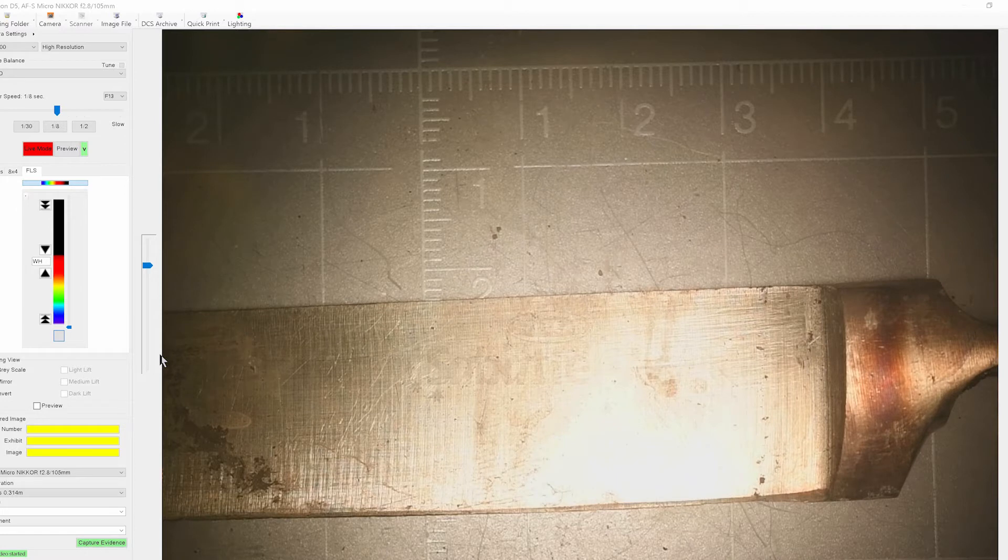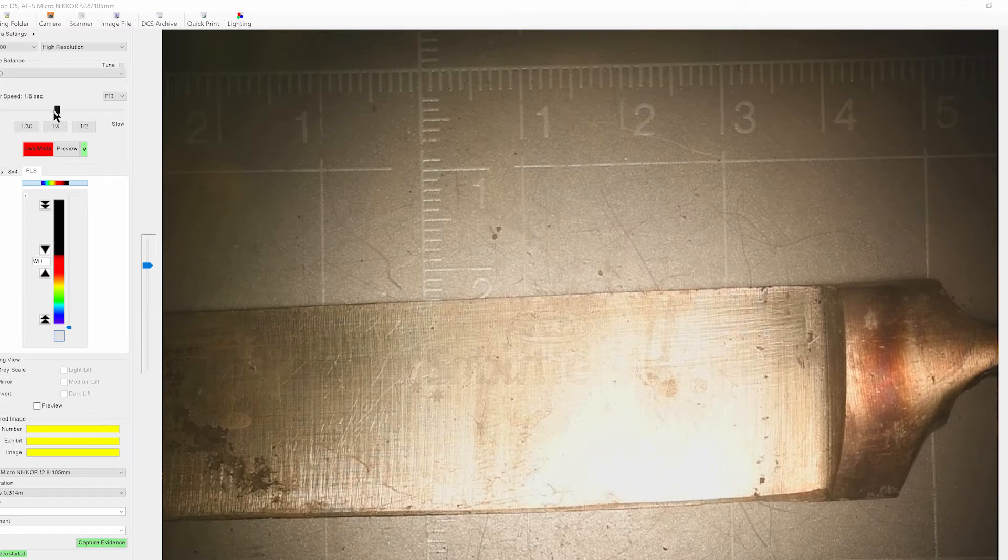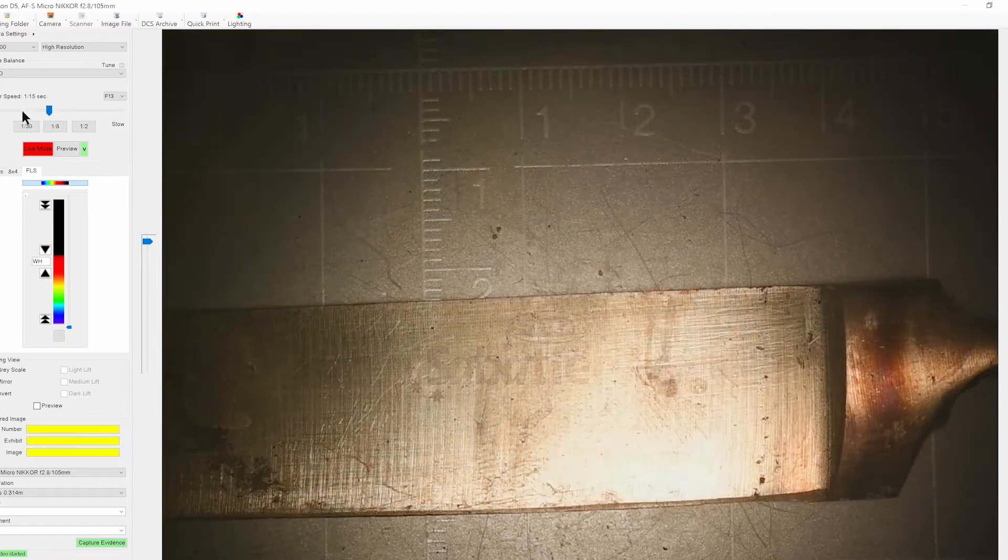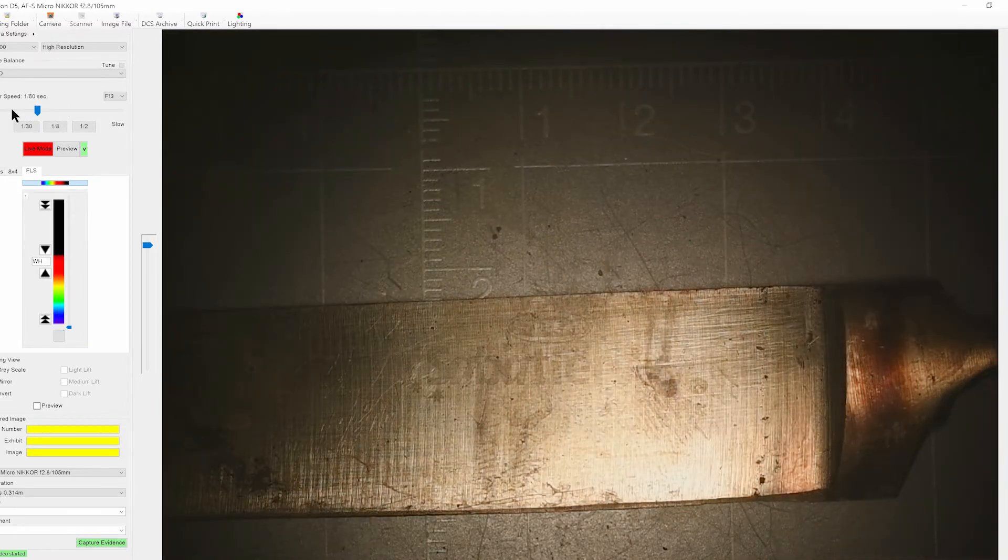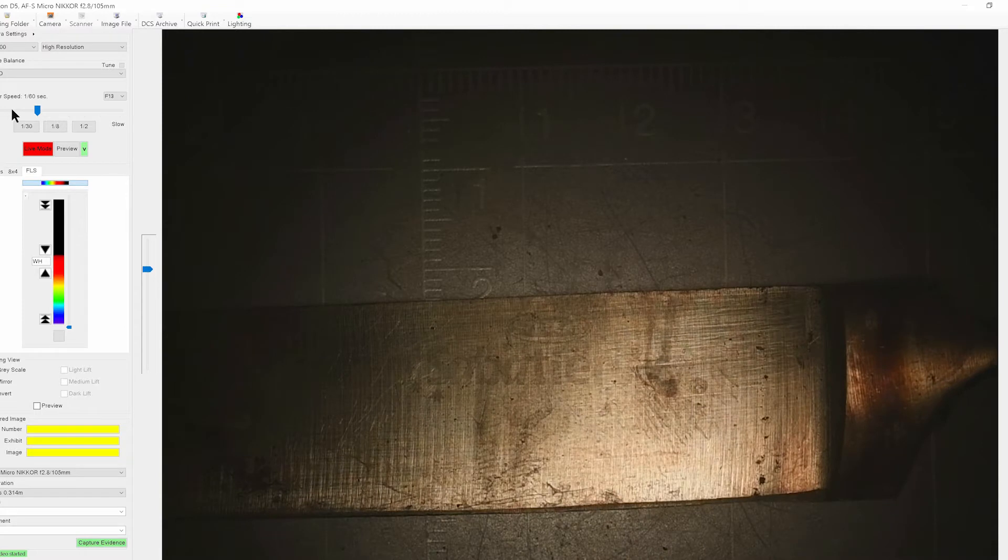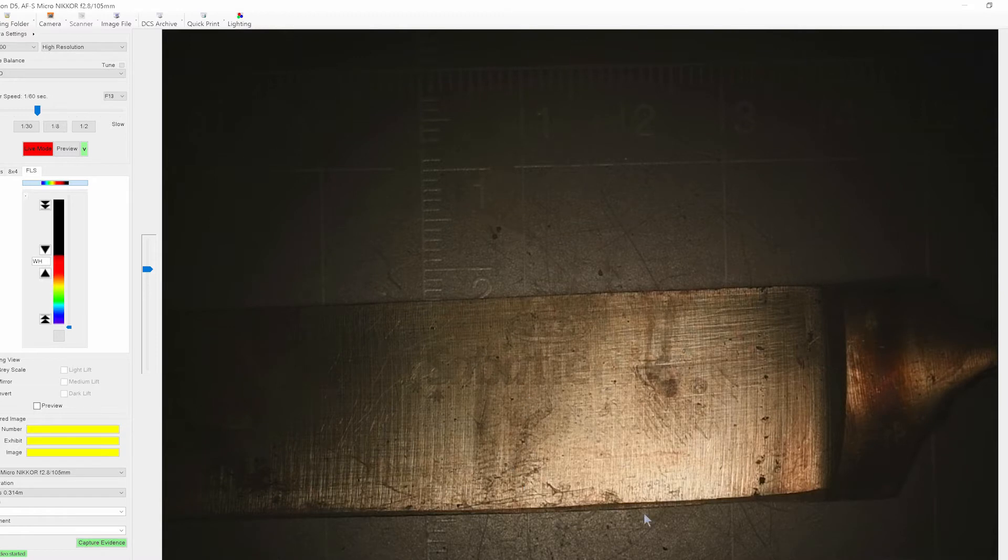Now coaxial illumination removes a lot of that reflection and glare from the sample. Now here with the sample we're just going to make some adjustments to our exposure and we can see here we have the slight outline of a finger mark on this knife.